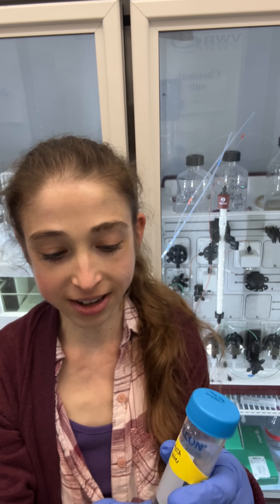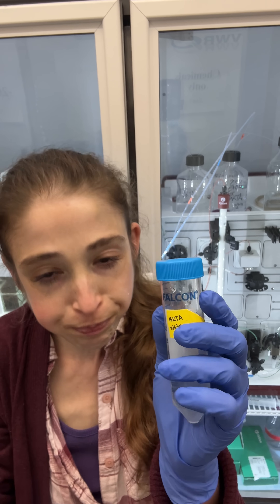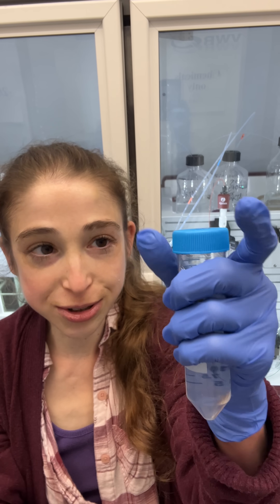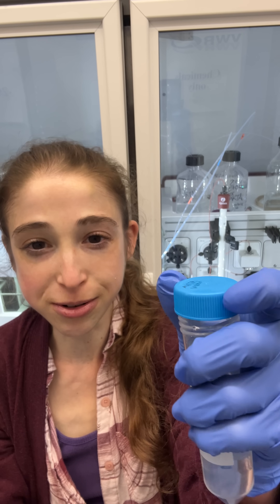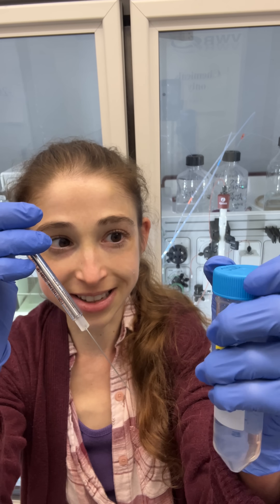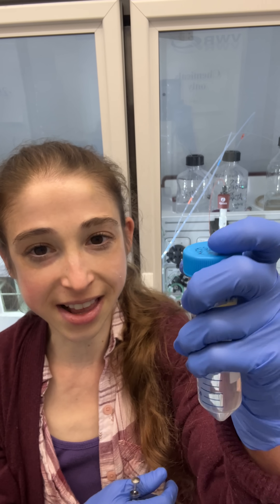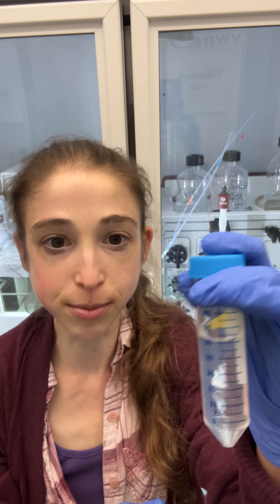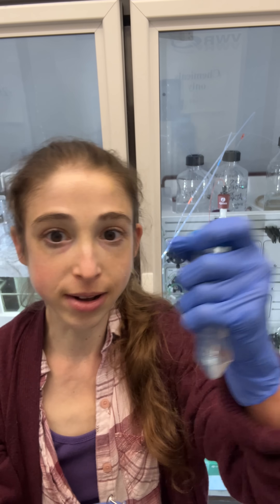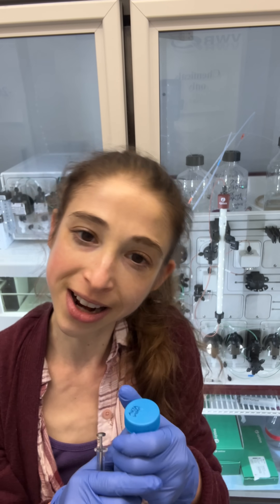A lot of times people when they're starting out understandably want to have a tube in a rack when they're pipetting, but the problem is that you can't see things. So holding onto a tube, uncapping it with a single hand, getting ready — then you can do whatever you need to do with your other hand. A benefit of this too is that you don't have to put your cap down somewhere and potentially contaminate it. You keep it nice and close, and you don't worry about spilling tubes, even though you're holding it and not having it in a rack.